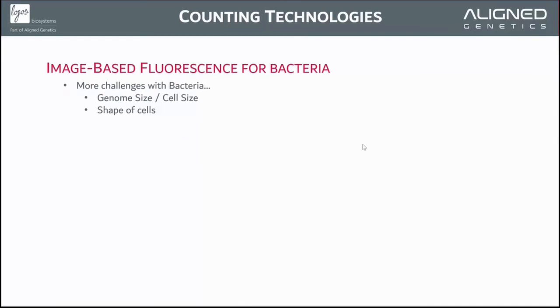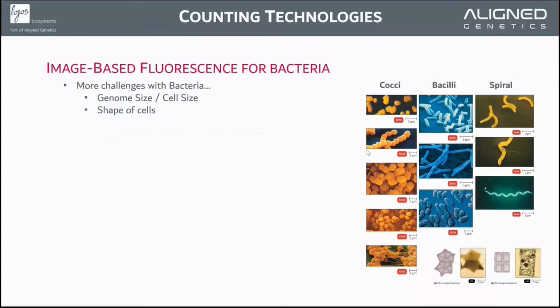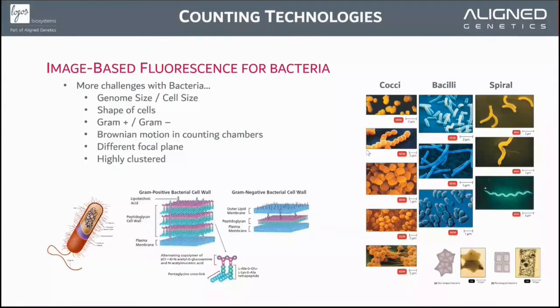When it comes to bacteria, we face even more challenges. The genome size and the cell size are around or below 1 micrometer. The shapes can be like these, but it can also look like a star or even a rectangle. But you also have the challenge of the wall.